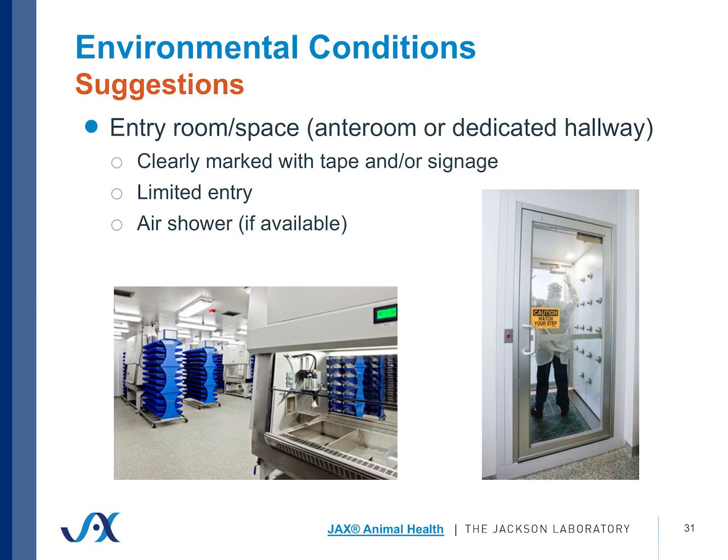Limit your entry. Make sure that only people who go into that mouse room are the ones who absolutely need it, and to know what the traffic is like. Not going in and out all day. Maybe not a great idea. If you could limit your time in there to one time in, one time out, that really just reduces the amount of airflow. It reduces the amount of particulates that have the chance to come in.